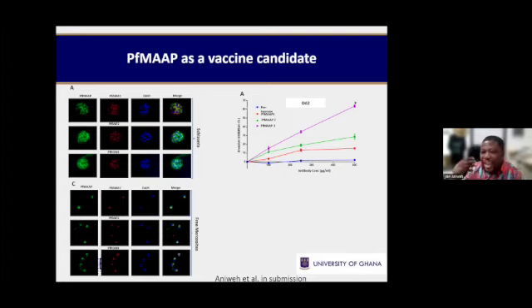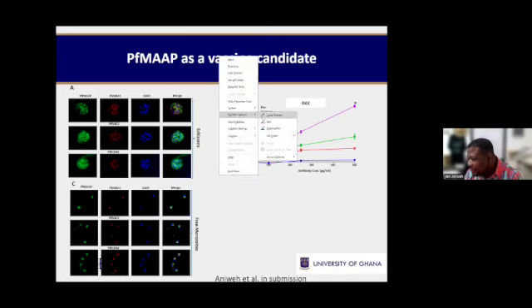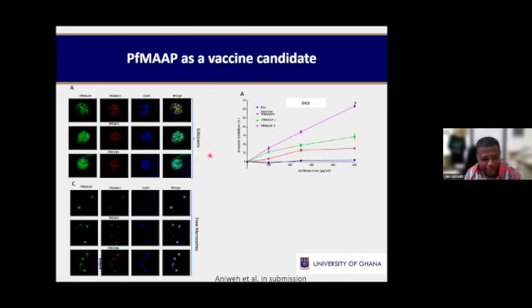We purify antibody from patients and use the antibodies to probe the antigen. And if you look at the late stage of the, let me get a pointer. Can you see my pointer?